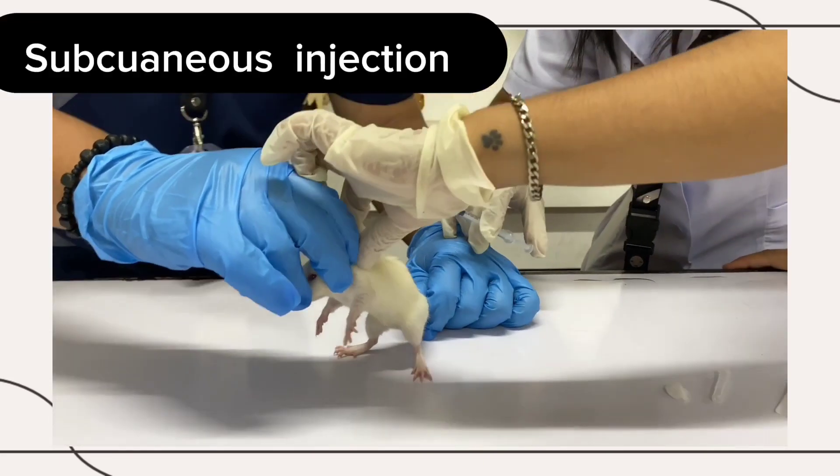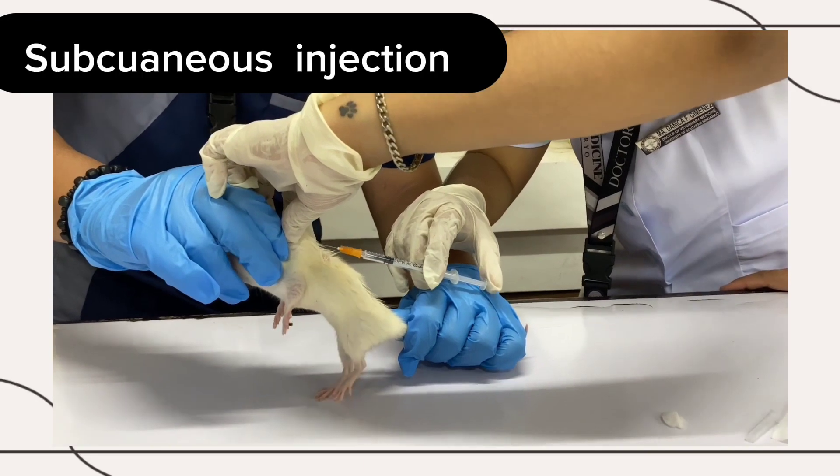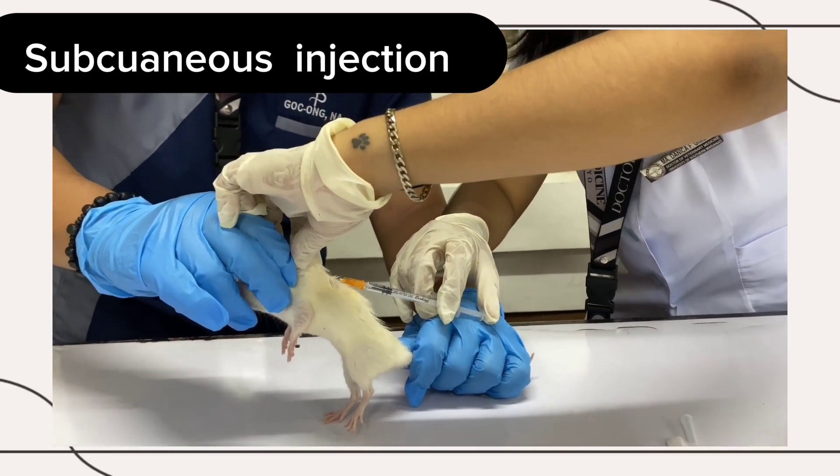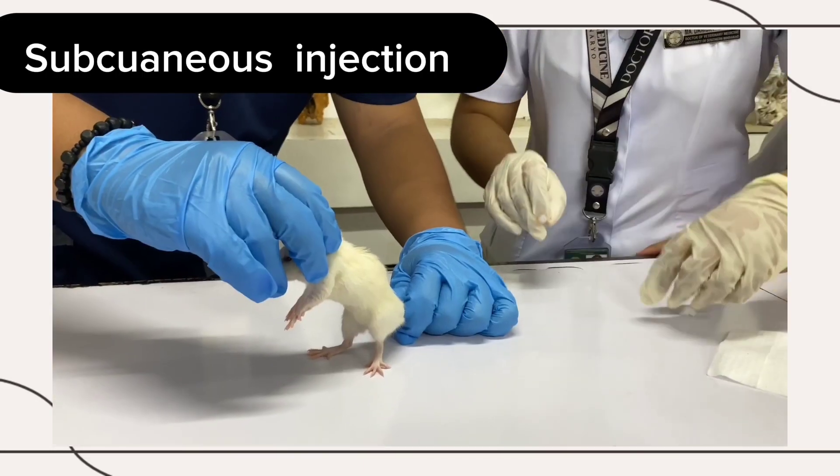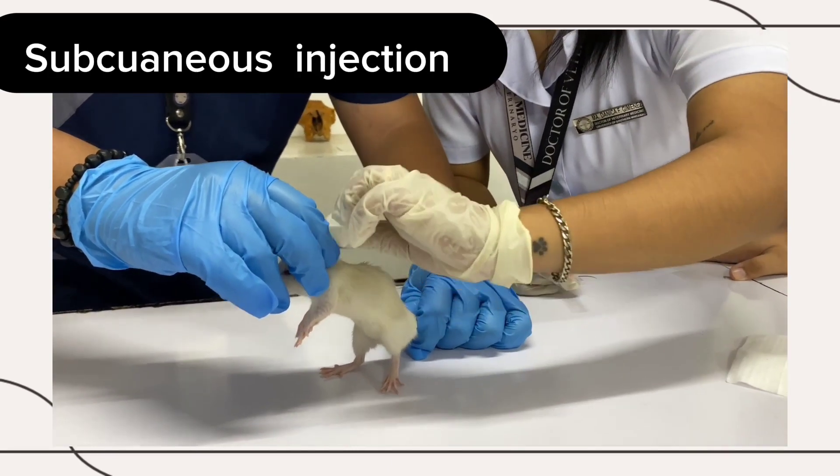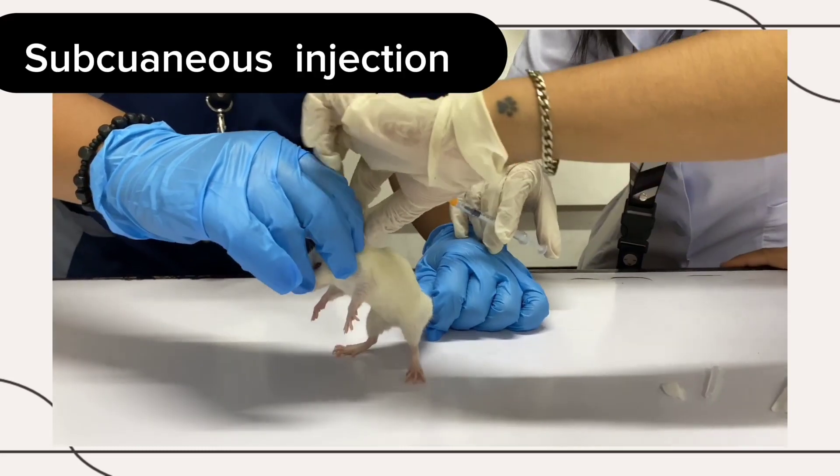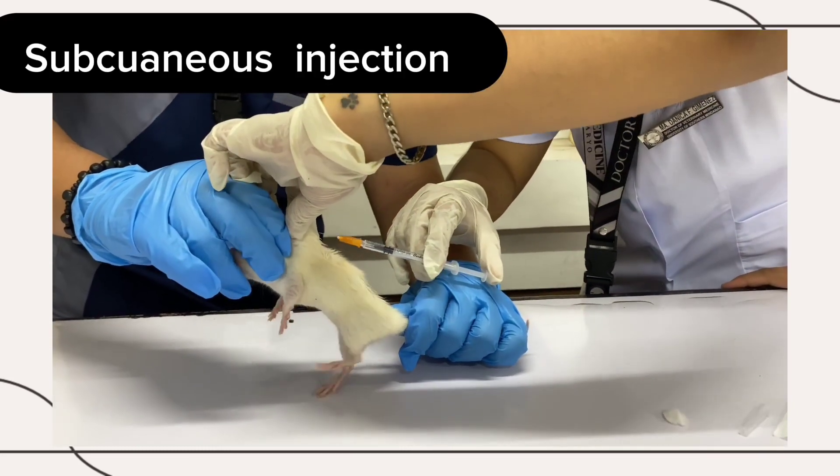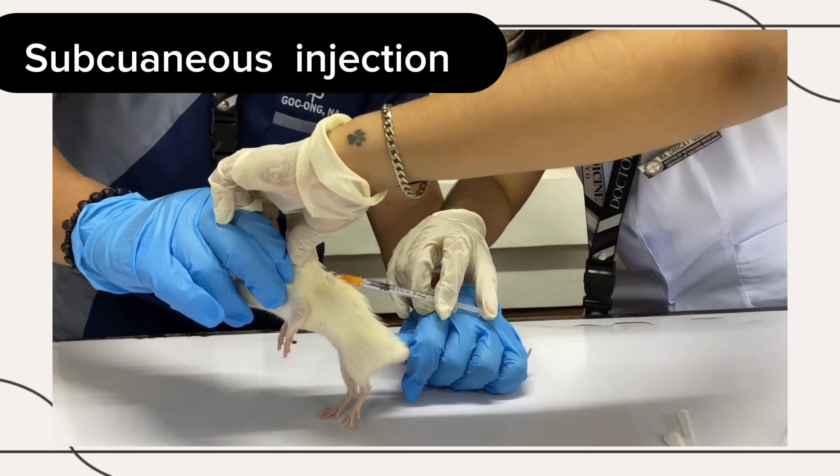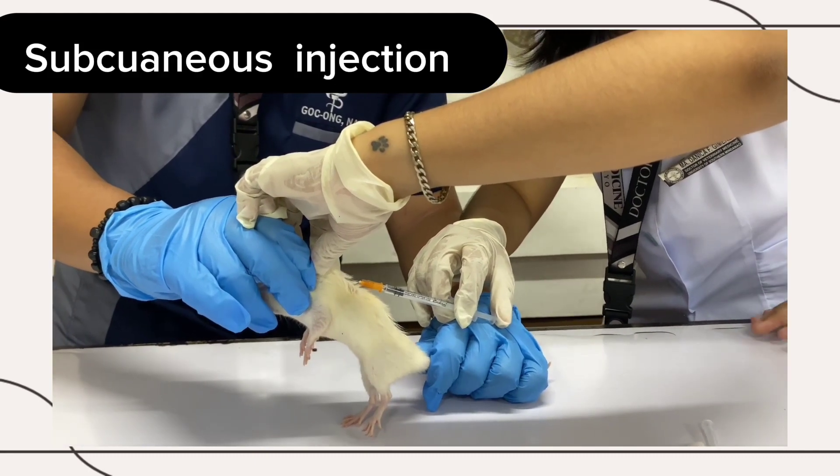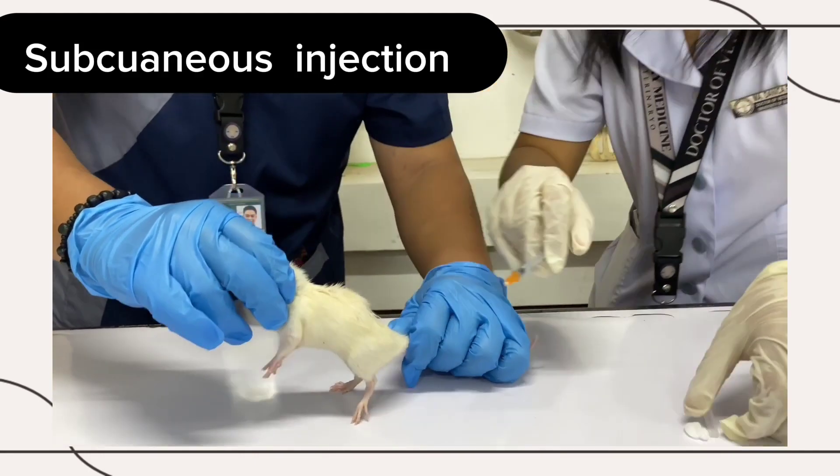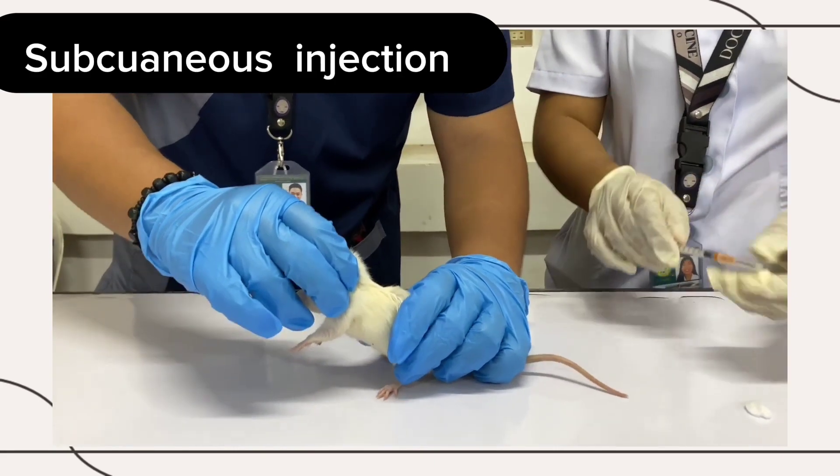Subcutaneous Injection: This method involves injecting a substance under the skin of the mouse. Prepare the injection site by cleaning it with alcohol. Pinch up a fold of skin between the thumb and forefinger. Insert the needle at the base of the skin fold at a 45 degree angle. Slowly inject the substance. Remove the needle and gently massage the injection site.